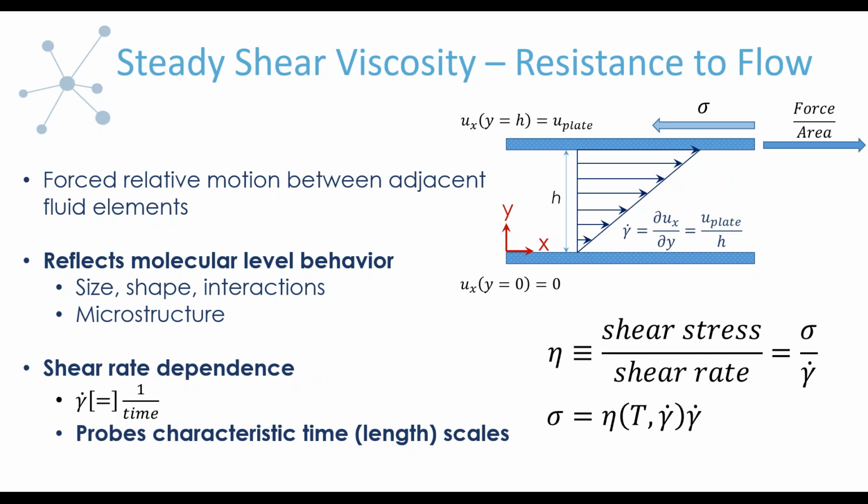you look at that functionality, wave vector has a dimension of inverse length scale. So as you change wave vector by generally changing either wavelength of light or scattering angle, you're looking at different characteristic length scales. So when you do low angle scattering at low Q or low wave vector, you're looking at large length scales, and you're going to be identifying any sort of network formation or larger length scale in the case of our protein aggregates.